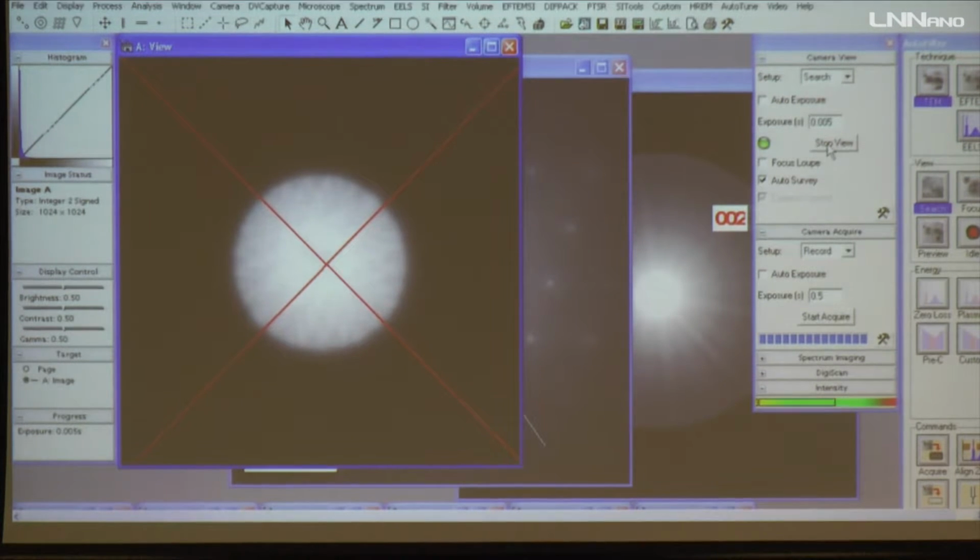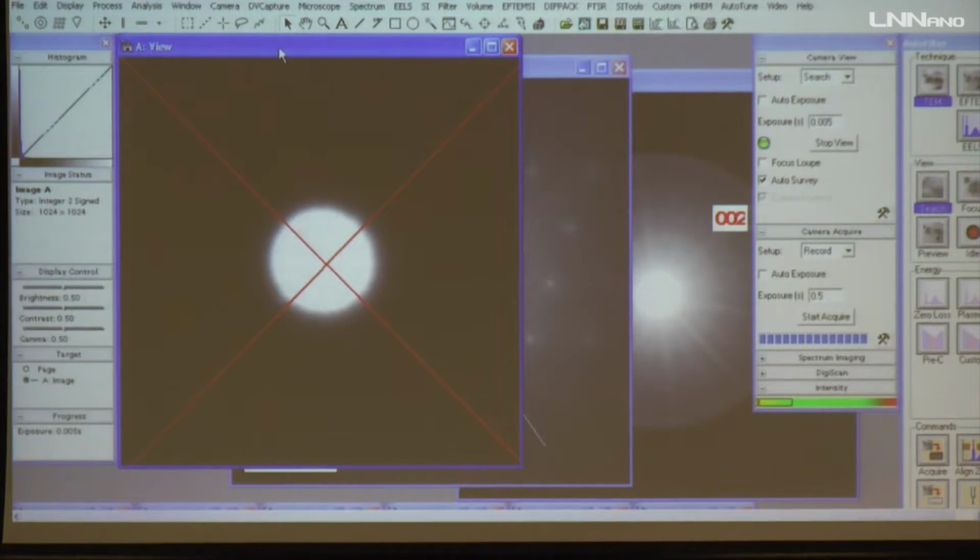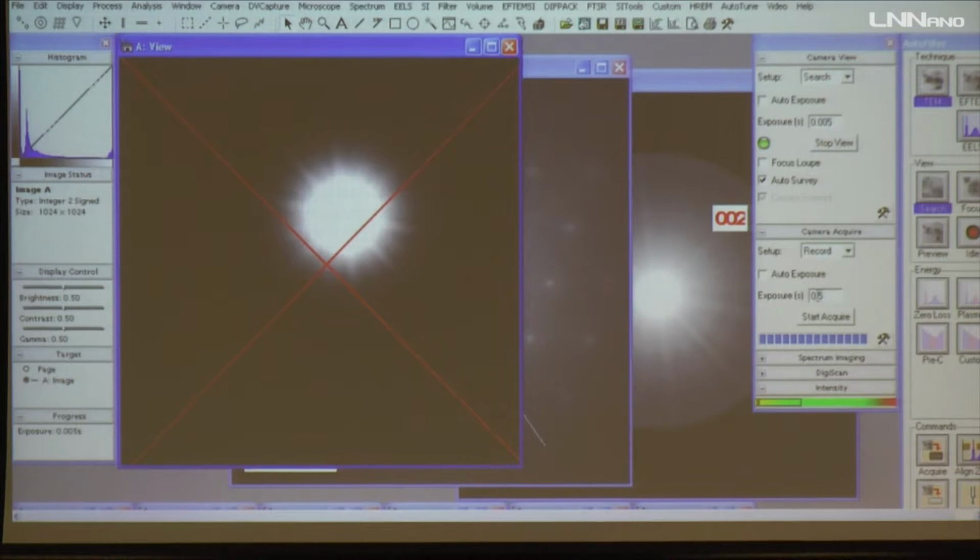One more problem here is that the CBD technique always needs to be operated in a focused spot mode. But here, as I'm using the CCD, I'm a little bit scared because it can damage the CCD. If I focus the beam very sharp, it can easily damage the screen. But I'll make it quicker.